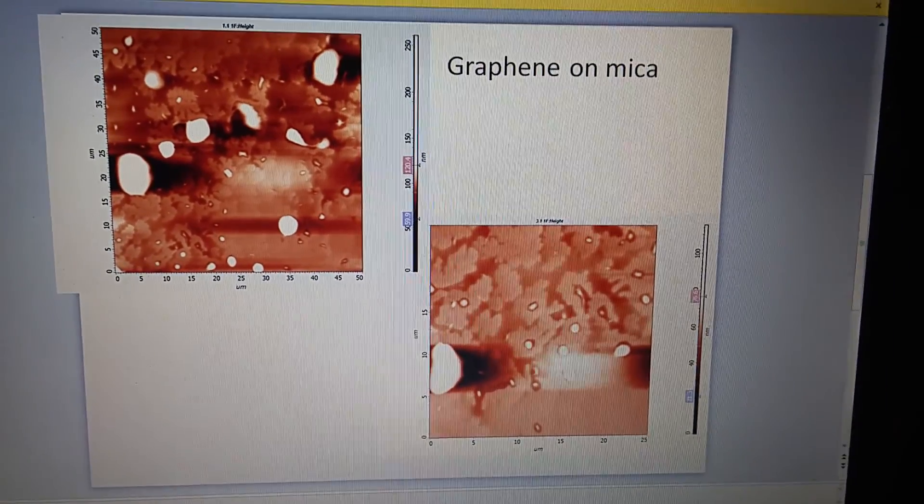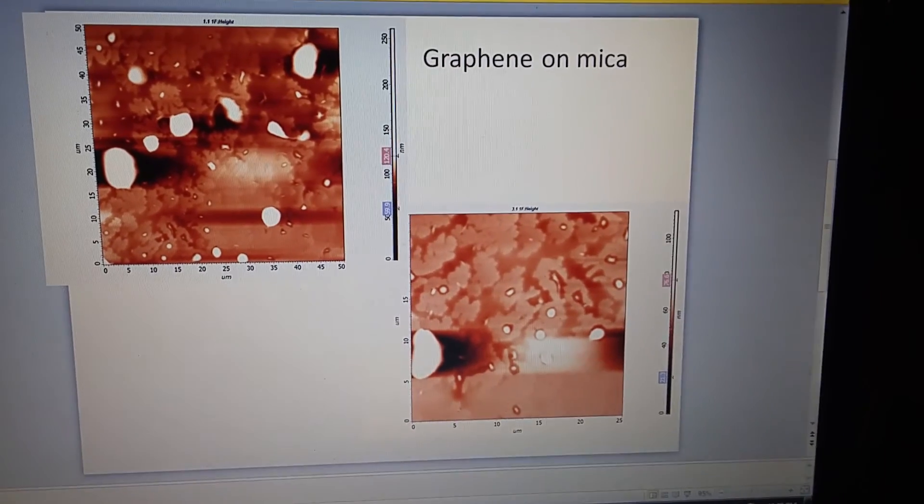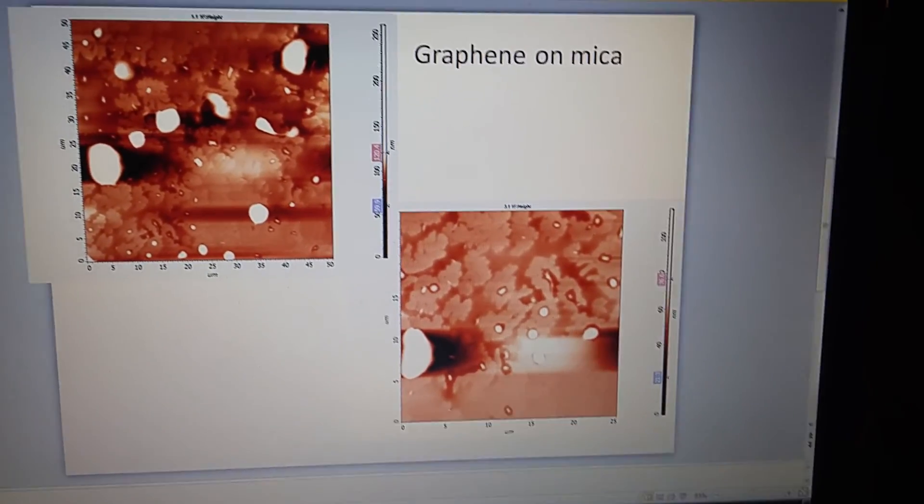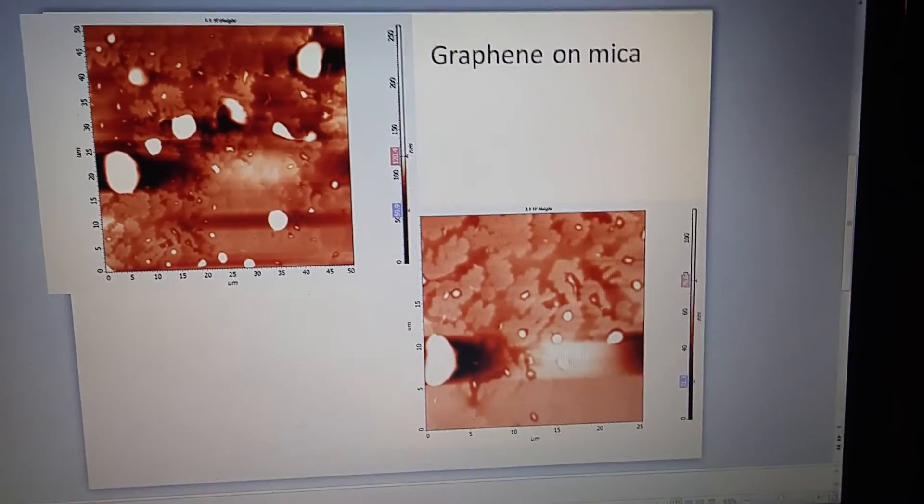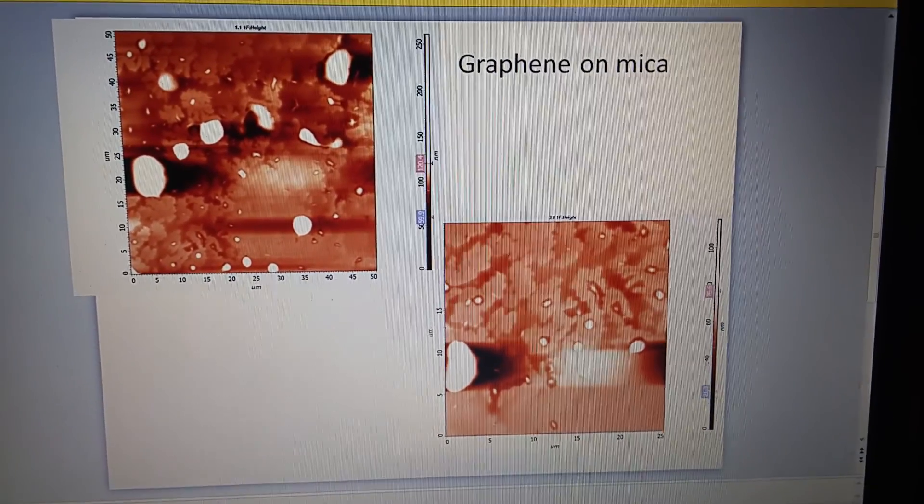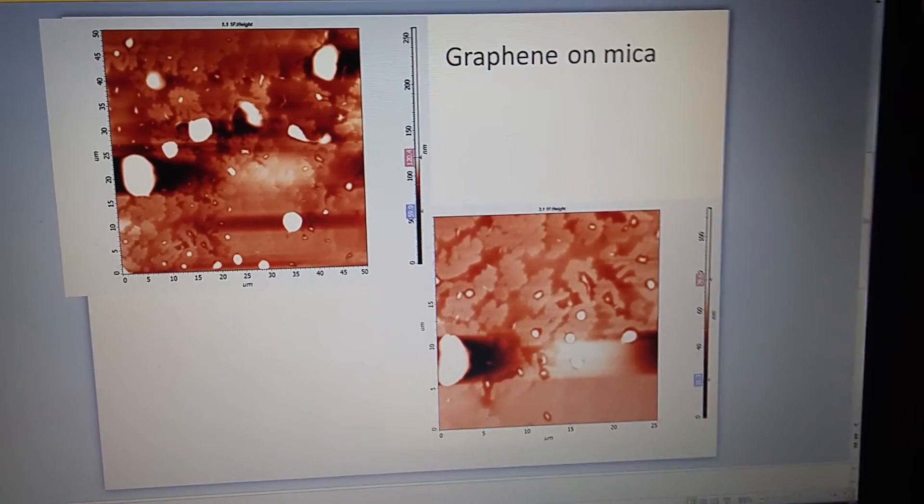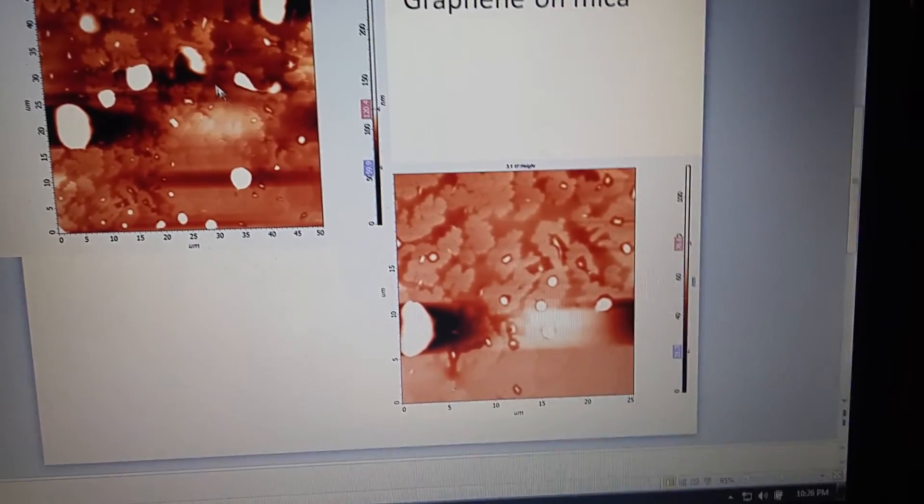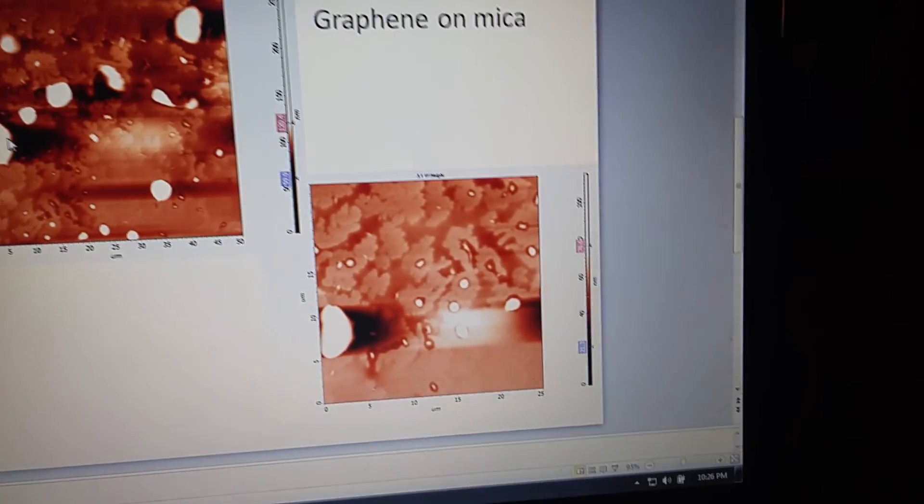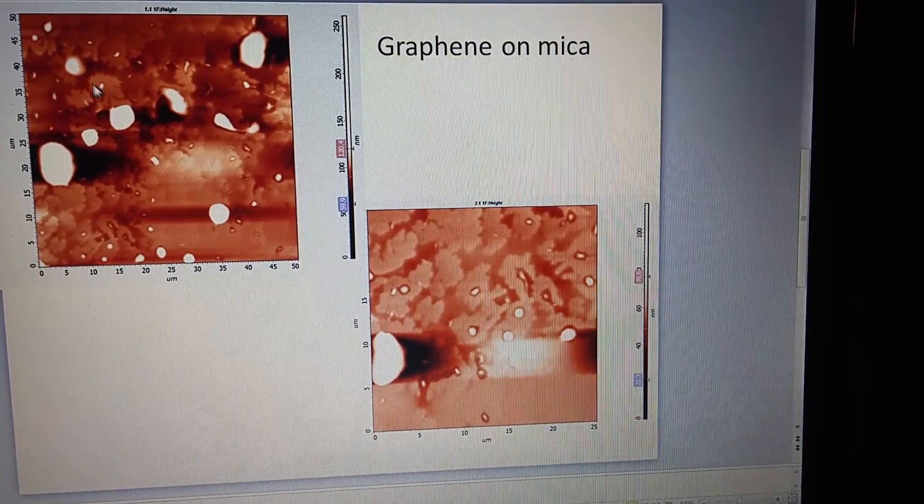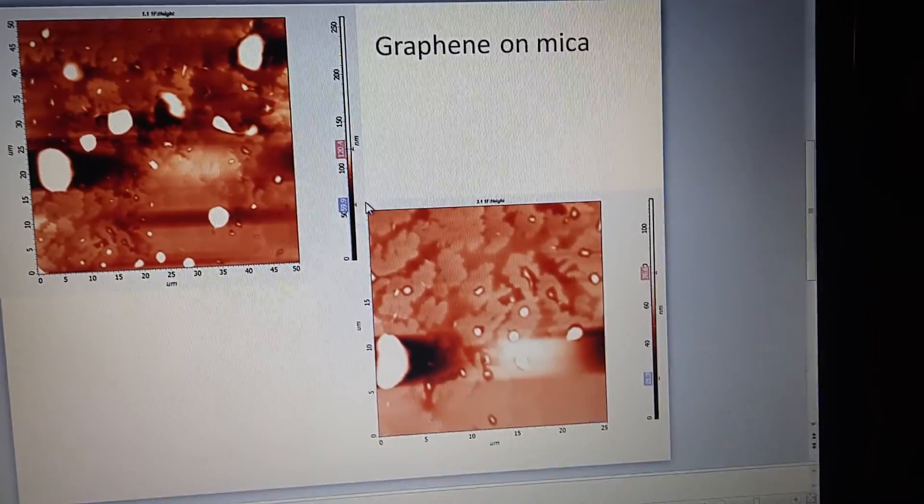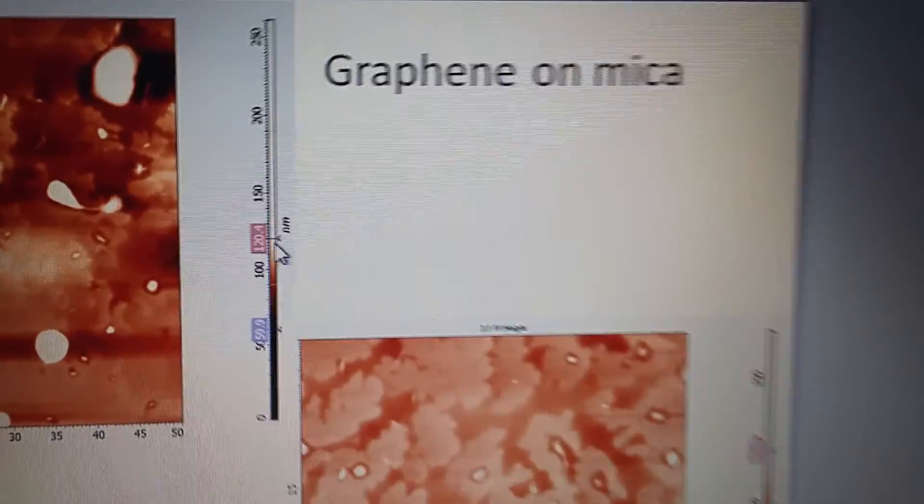So one of our users here on YouTube asked me to show the actual flakes. And this will be a little tutorial for those who want to know how you prove that you have graphene. This is actually the image. This is graphene right here. This is a giant flake right here, and these are other flakes and stuff like that. And you can see that right in here.